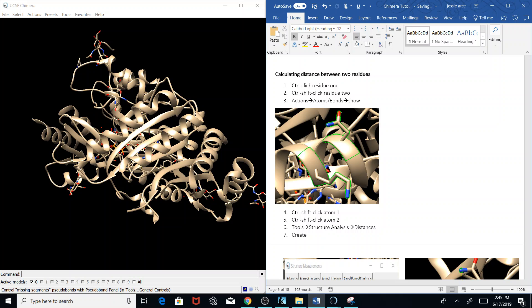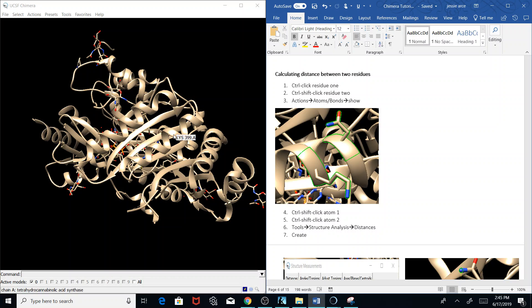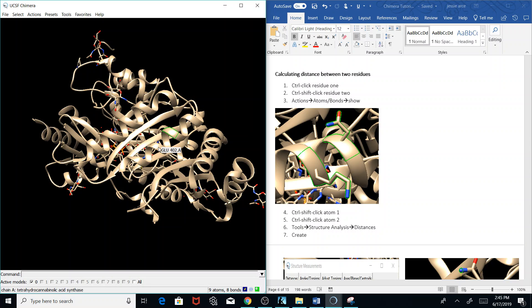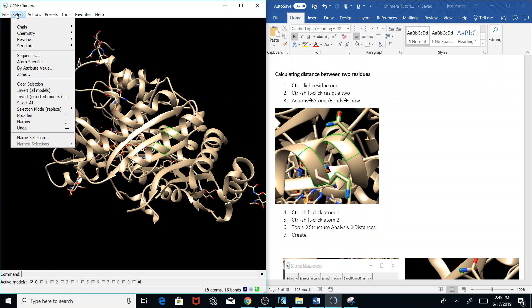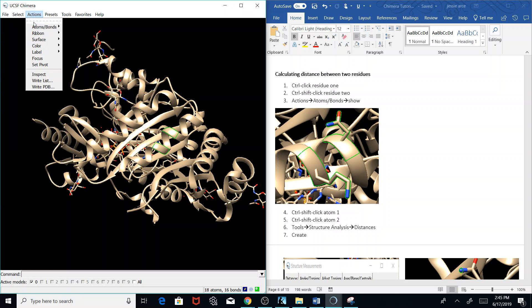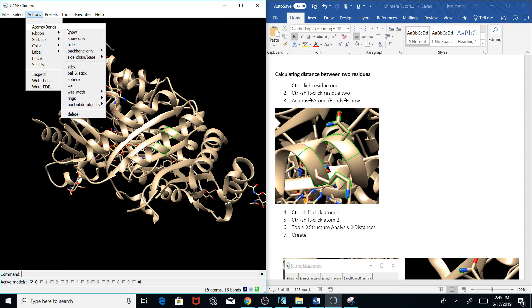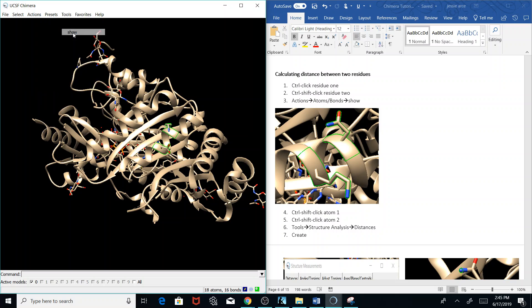Now I'm going to go over calculating the distance between two residues. First, we need to ctrl click one residue and then shift ctrl click the other residue, and go to Actions, Atoms and Bonds, and go to Show.